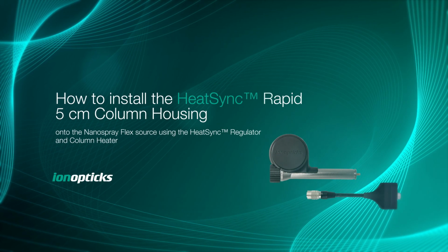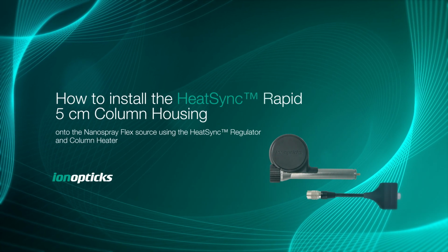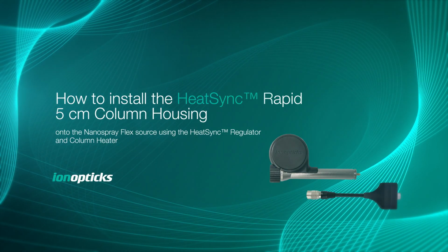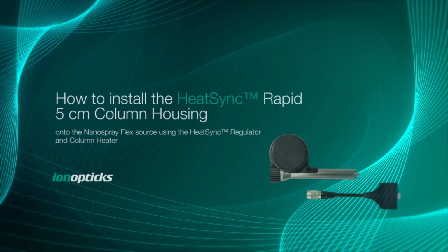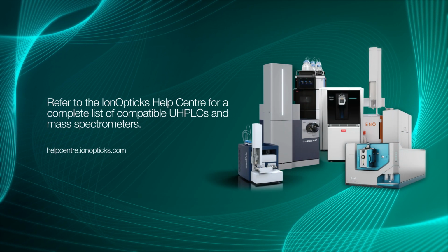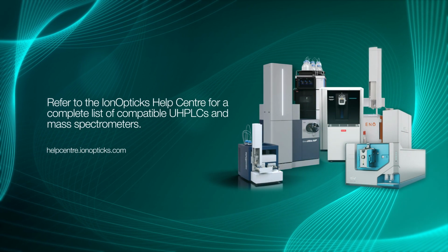This video demonstrates how to install the HeatSync Rapid column housing onto the Nanospray Flex source using the HeatSync Regulator and column heater. Refer to the IonOpticks Help Center for a list of compatible UHPLCs and mass spectrometers.